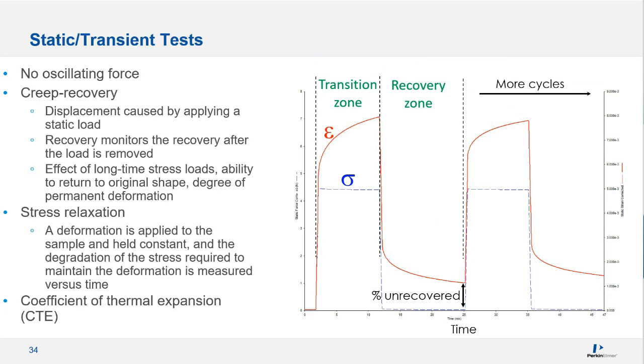DMA can also be used without applying the oscillating dynamic force. These methods include creep recovery, stress relaxation, and the coefficient of thermal expansion. So let me use just one slide to briefly touch upon these methods.